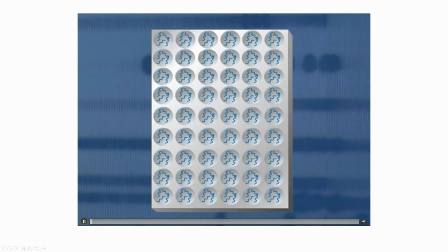A microarray is a small silica or glass slide, which is the size of a postage stamp, that contains thousands or even hundreds of thousands of spots. Each spot contains a synthetic piece of DNA with a known sequence. A microarray consisting of partial. So these sequence, those are sequence here, that will be the probe, okay?